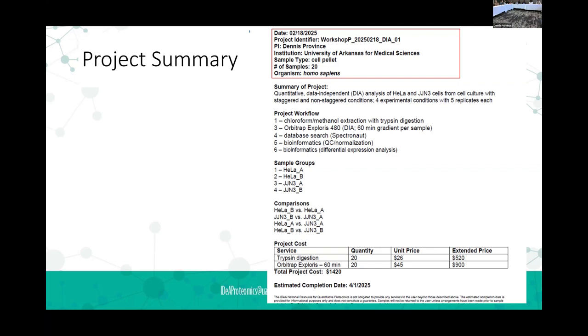And one of the things that Rick brought up yesterday that I wanted to reinforce is that some of these things that we're telling you that are needed or necessary for proteomics, it's not just for our place. It's like any place that you would go, you would have to have essentially similar requirements to do proteomics.